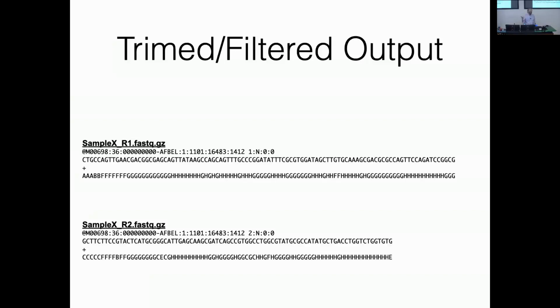But still, if it's mRNA, you're not going to get any introns and stuff, but you're still randomly fragmenting. Most mRNAs are bigger than the read length that we're using, even if it's 250 base pair reads.